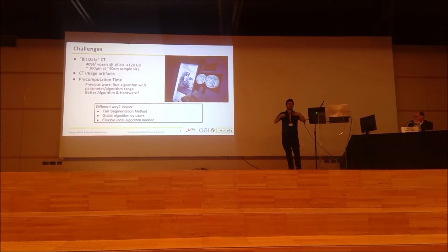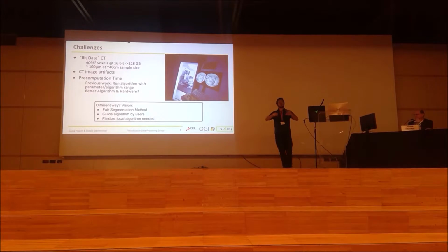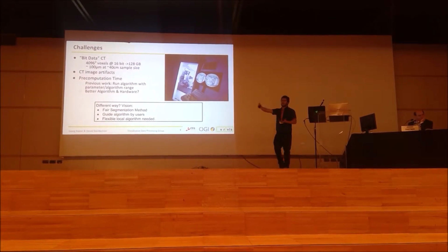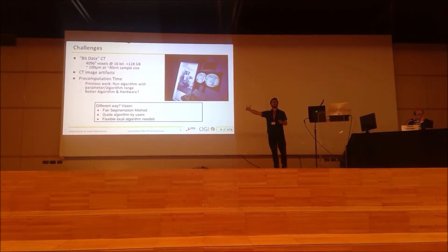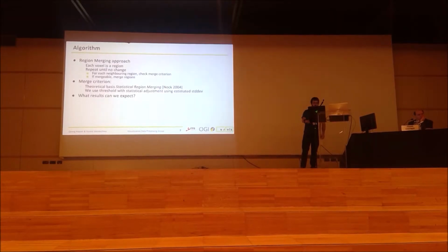This was the naive vision we had. Have a fair segmentation method which works reasonably well, and then give the difficult decisions to the user, involve the user of the segmentation method in order to guide the algorithm towards a good solution. This was the main idea.